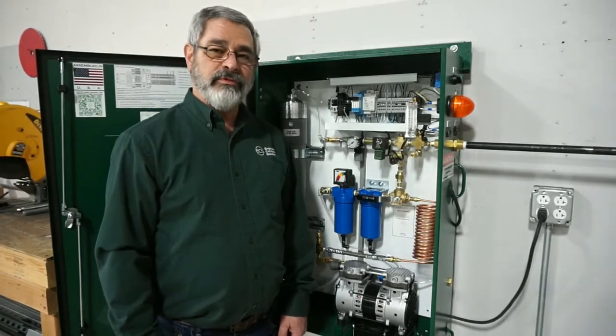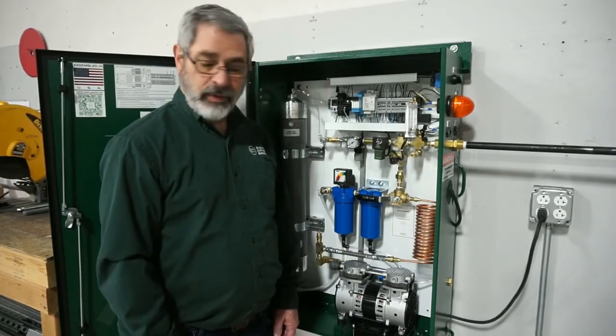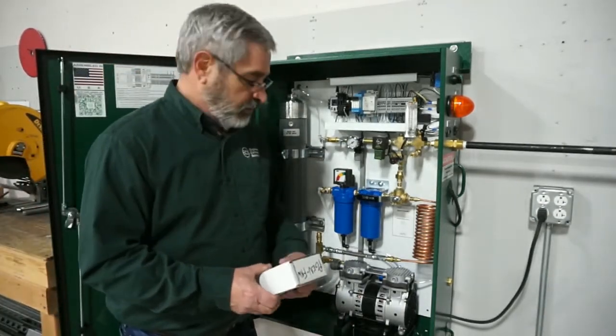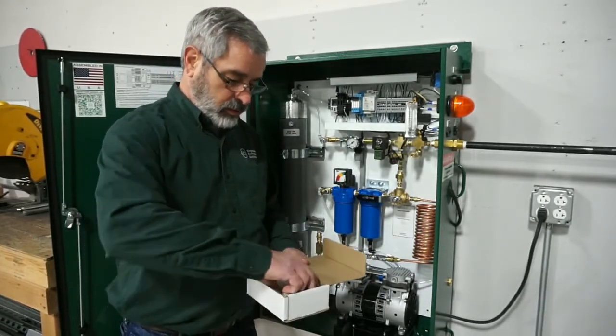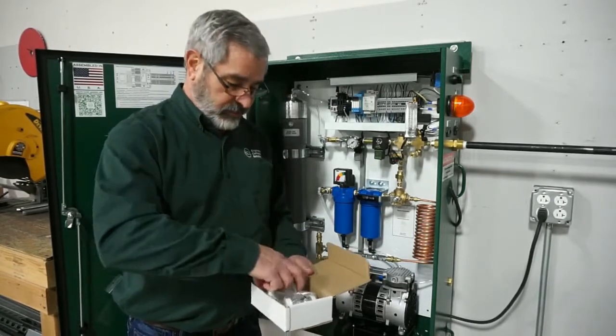Today we're going to do a replacement filter kit on the ECS wall-mounted nitrogen generator. First step is to get the filters. The filters on this one — there are two filters: a water separation filter and a coalescing filter.